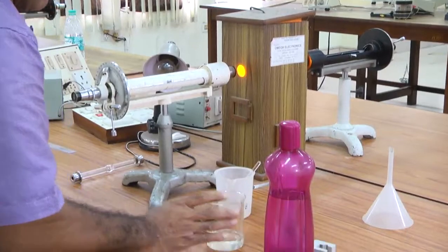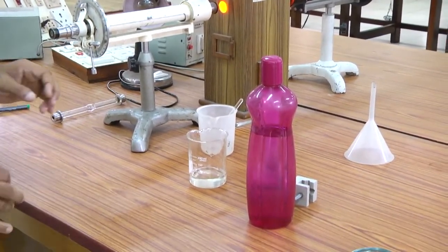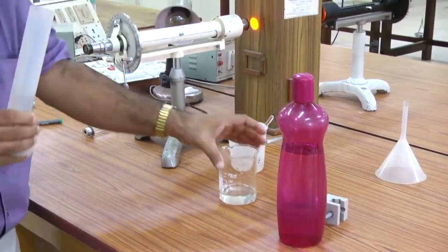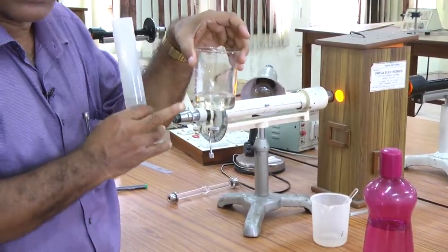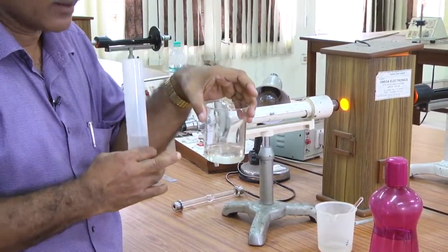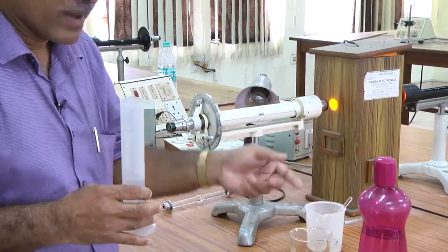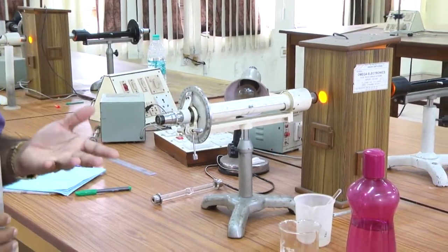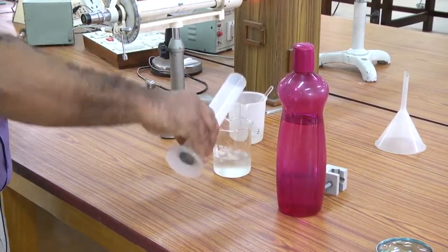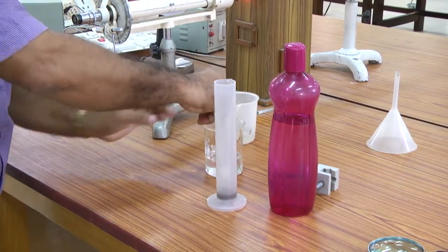If it is a 20% solution, you take some 100 ml or 50 ml of that solution, and calculate, to make it 15%, how much water I have to add. So, you put water into that. Okay, make it a uniform solution.